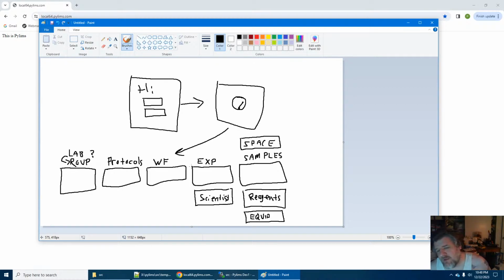I don't know if I want to call that. I don't know how far upstream I want to go, like, do we want teams within groups? Probably something like that. Alright, so in addition to scientists that are running that experiment, we also need a supervisor.